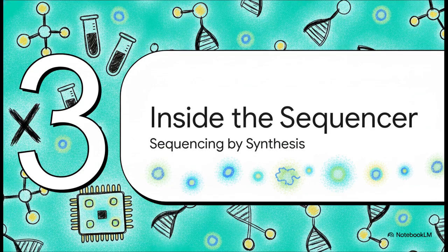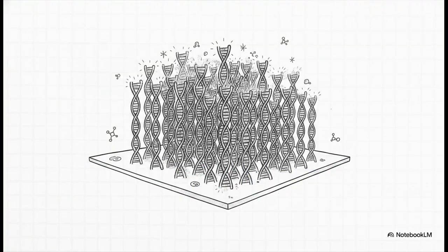All right, Section 3, inside the sequencing machine. This is where we look at sequencing by synthesis. We are officially leaving the test tubes behind and stepping into the Illumina sequencer to witness what is basically a microscopic light show. Our barcoded DNA fragments get loaded onto what's called a flow cell. This is essentially a glass slide containing billions of tiny wells. Through a really clever chemical process called bridge amplification, single DNA fragments attach to the slide and are copied over and over again in a localized area until they form a dense cluster.